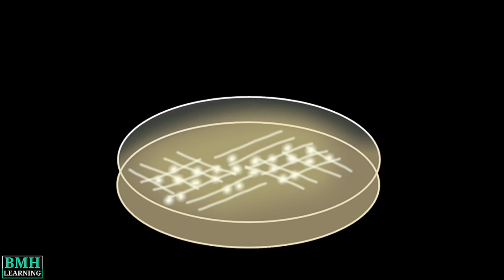The colonies should not be dislodged with the bile reagent. The plate is kept right side up and is incubated at 35 degrees centigrade for 15 to 30 minutes. The plate can also be placed on a heat block as a substitute for the use of an incubator. The flattening of the colony is observed. Proper observation should be made to ensure that the colony does not simply float away.